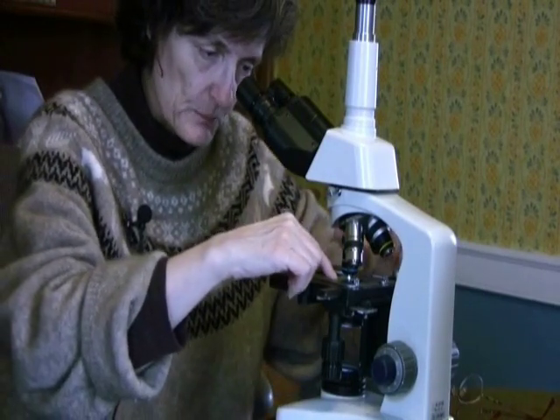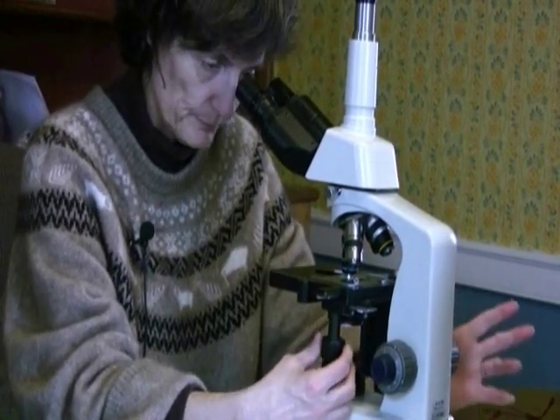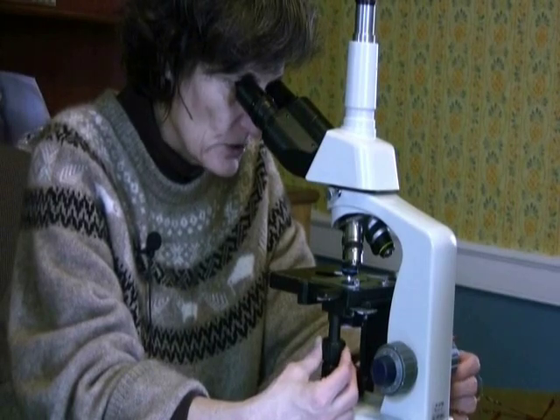If you are trying to move this slide with your fingers, it's just hopeless. You will be very aggravated. You won't be able to do a very good job of finding your organisms.